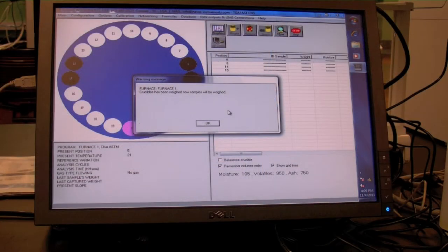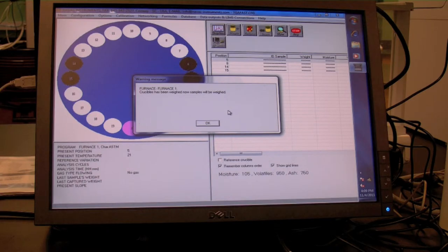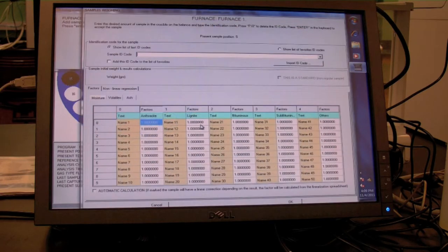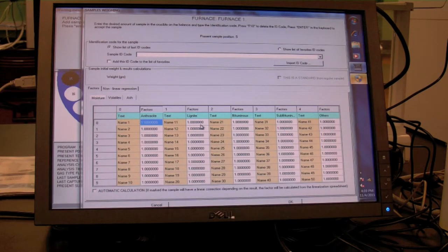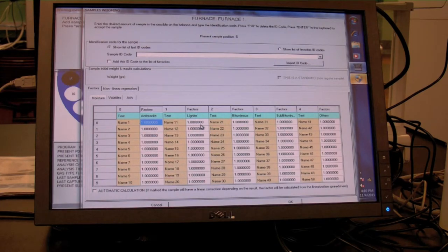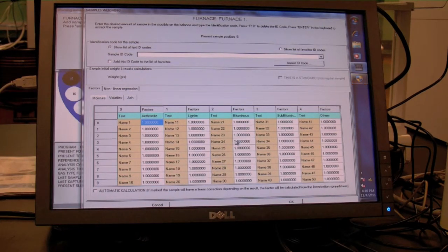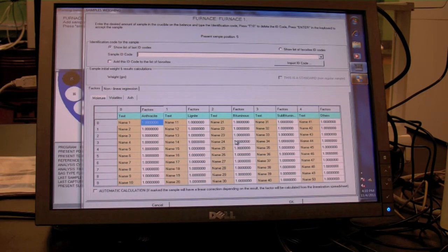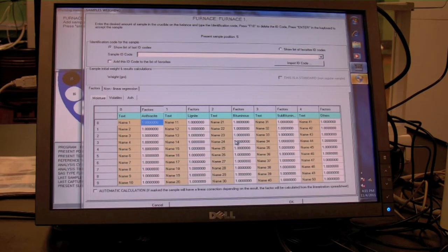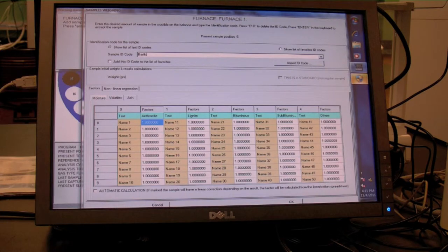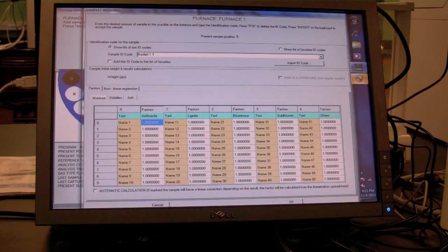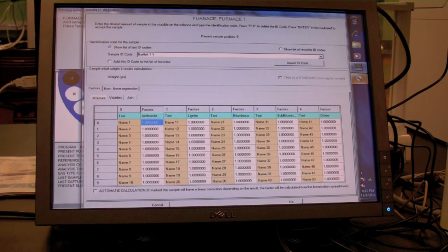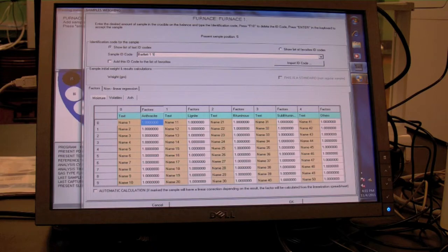A window will appear indicating the crucibles have been weighed. Press OK. Sample information can now be entered. For the first sample, create a new sample identifier by typing an alphanumeric name in the prompt box. A good sample identifier is analyst last name, sample number, and replicate number.